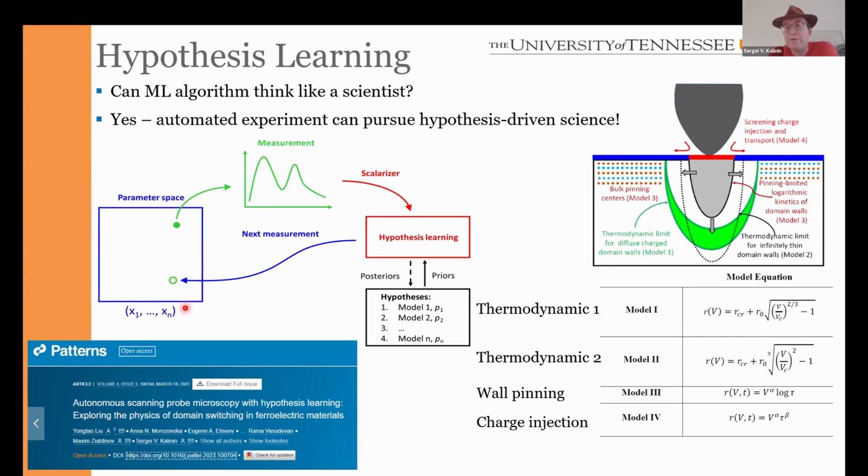So this is a simple example of the fixed policy experiment. A more complex example of an experiment with a defined reward function is what we call hypothesis learning. Many of you have heard about ideas of having a machine learning agent that does experiments and generates new knowledge. Most of the time, these ideas are coming from the machine learning community, where the concept of the experimental footprint, meaning the necessary amount of equipment required to falsify a hypothesis, is simply not considered.